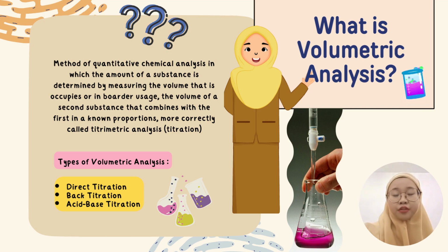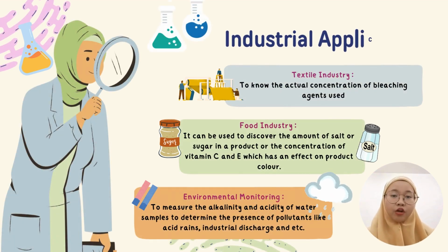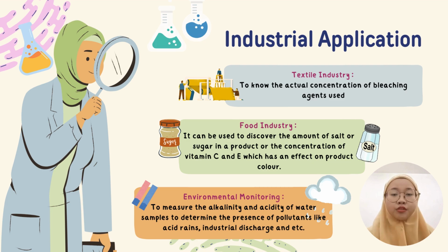There are three types of volumetry analysis. The first one is direct titration, second back titration, and the last one is acid-base titration. Next, we're going to the industrial application of volumetry analysis. So, there are actually three types of industry that we can apply with volumetry analysis.